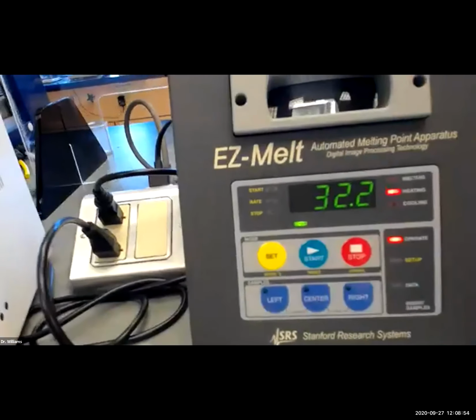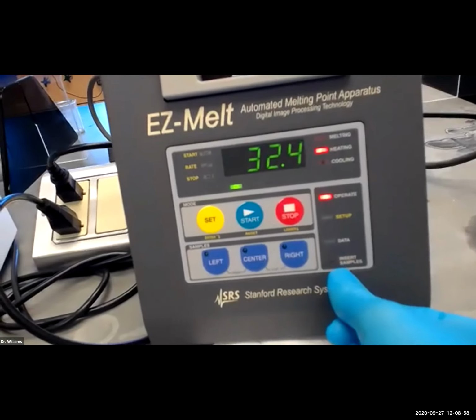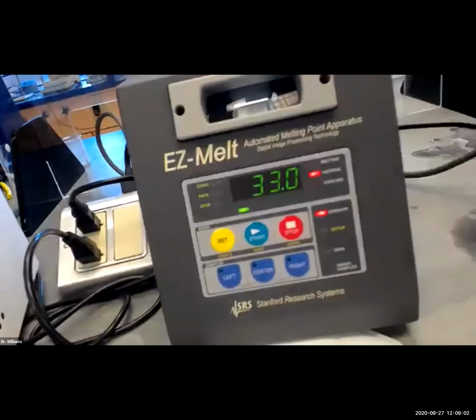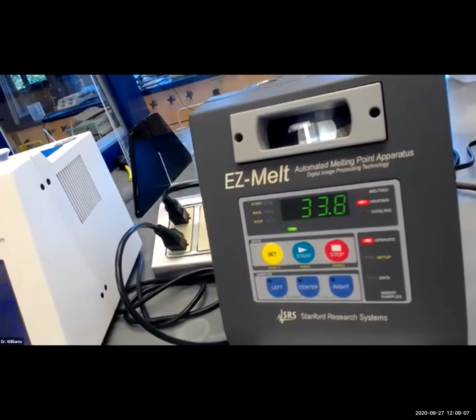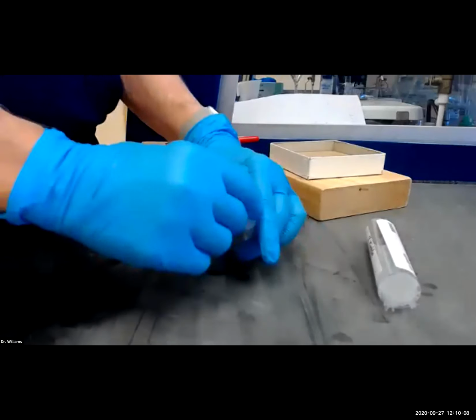That's going to bring it up to the appropriate start temperature, and then this will illuminate and it will say insert samples. All right, so let's take a look at the preparation of our sample. Okay, so now we're ready to prepare our sample.